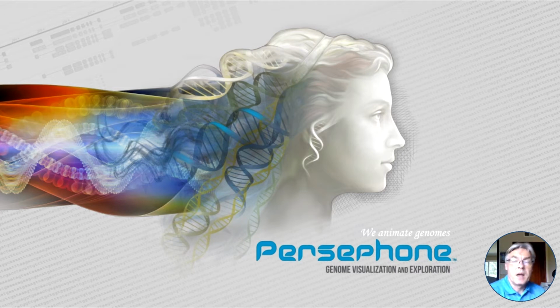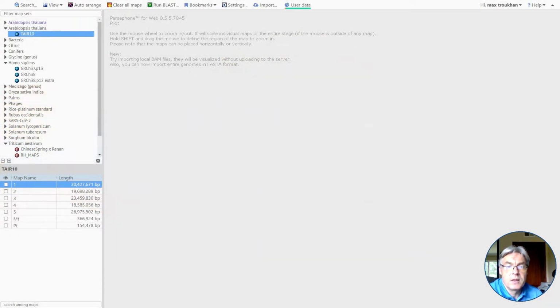Hello, I'm going to present our system called Persephone. It's basically a powerful genome browser. It's a system for storing and visualizing genomic data with some analytical tools. We've been working on it for more than 10 years, and now I wanted to present the web version that will run in your web browser and is more portable than the Windows version, the original one.